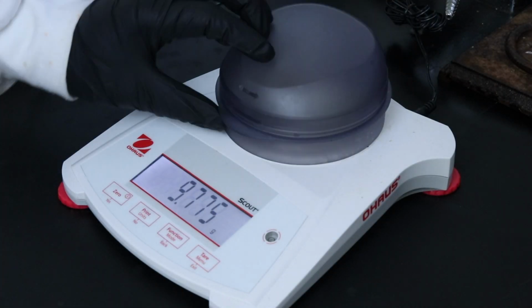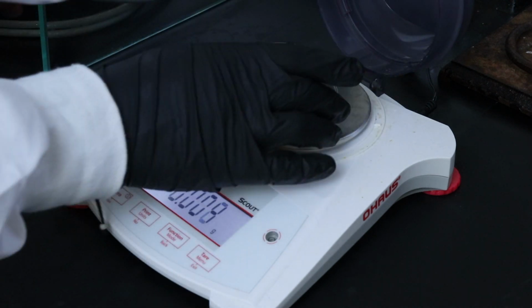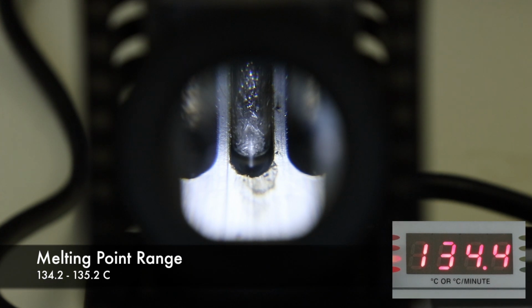Now I can weigh out the crystals to calculate a percent yield, the empty watch glass being 9.736 grams and the full watch glass being 9.759 grams. I'll get the melting point range for the product now, starting a few degrees below 135, and it looks like this starts melting around 134.2 degrees and finishes around 135.2 degrees Celsius.